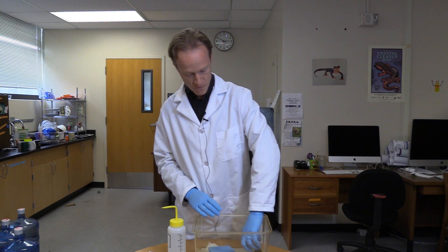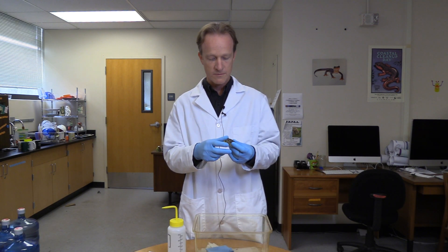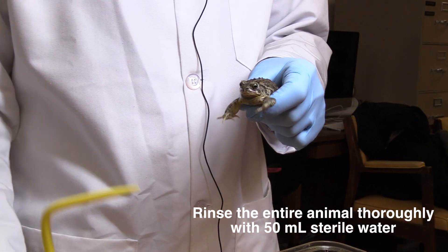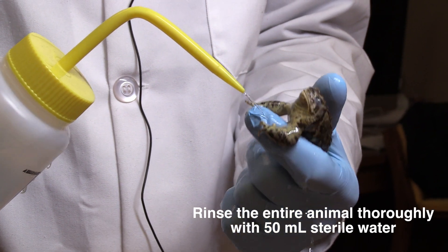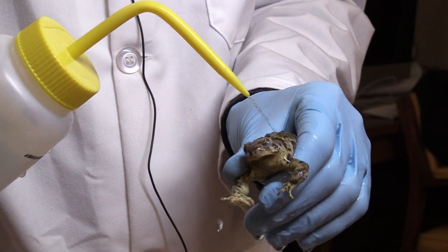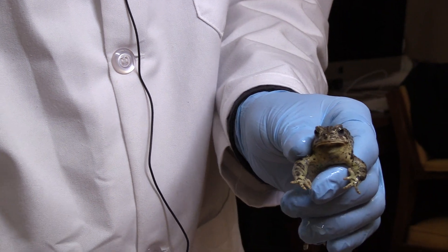Today I've got a Wyoming toad, Anaxiris baxteri. I will start by using approximately 50 mils of sterile water, and I'm going to rinse the animal. The idea behind that is to rinse any bacteria that might just be stuck on the animal, as opposed to the bacteria or fungi that are actually living on the animal. We want to tease that apart so that we're looking at the actual communities that are in symbiosis with this host.